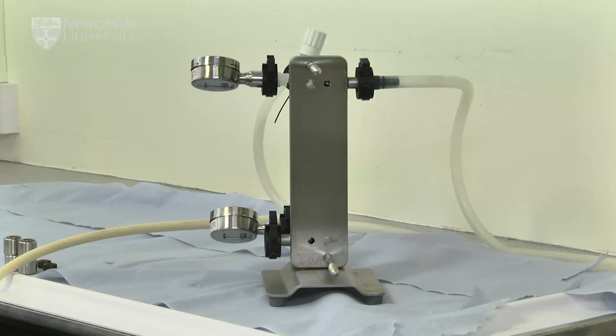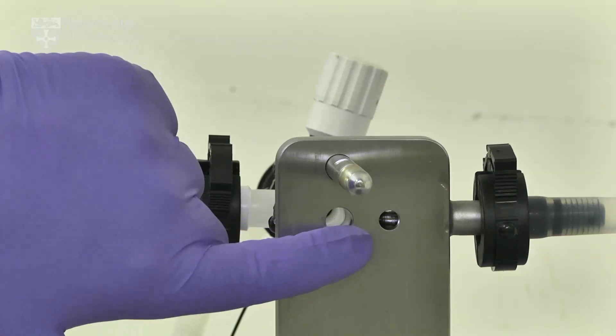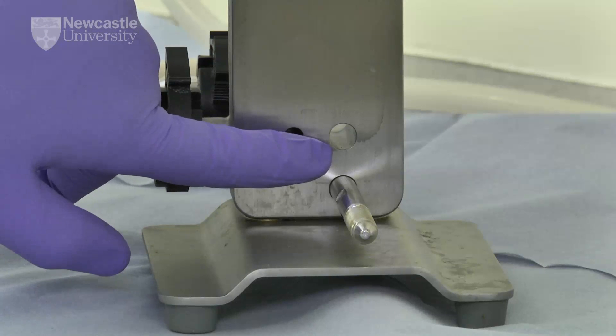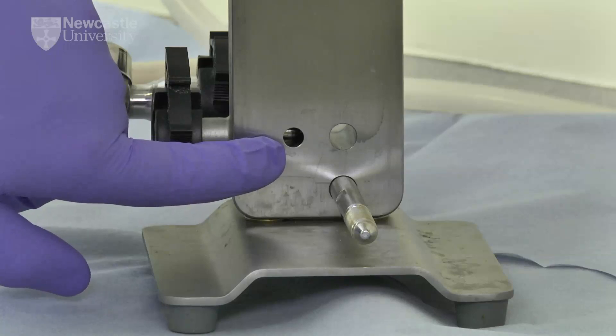This is the manifold plate. The retentate is collected from this port. The permeate is collected from this port. The feed enters the cassette through this port. And the final port allows for the addition of a permeate pressure gauge.